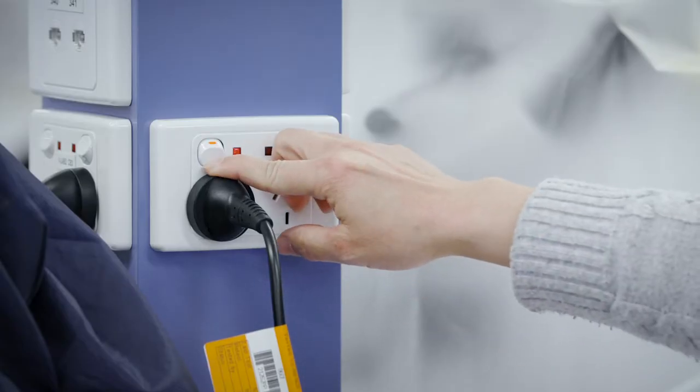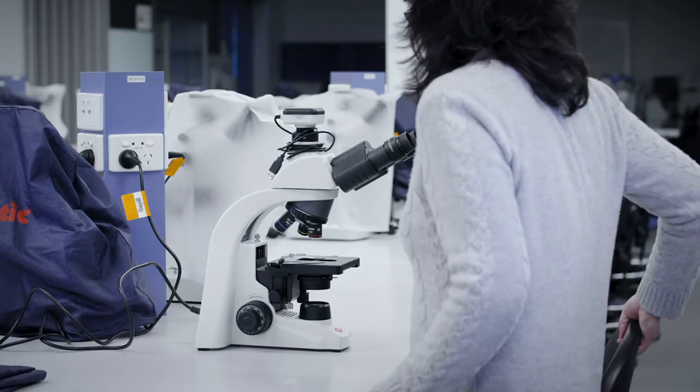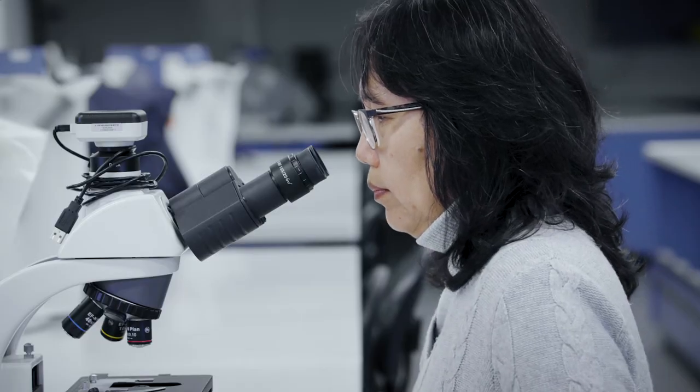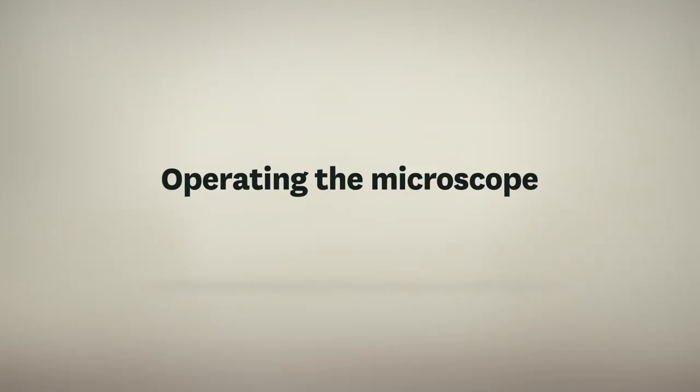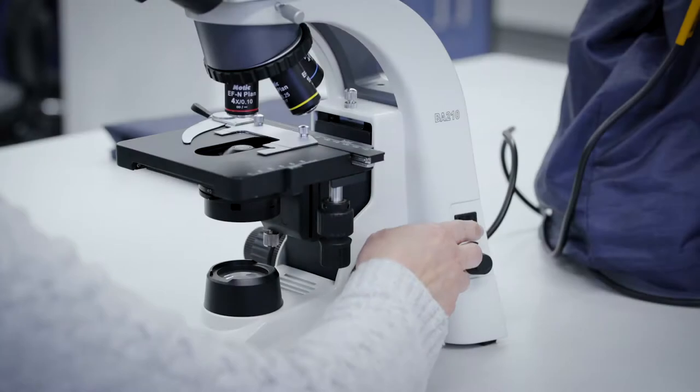Connect the microscope to the power. Sit down and adjust the seat height so that your eyes are just above the eyepiece. Turn on the microscope.